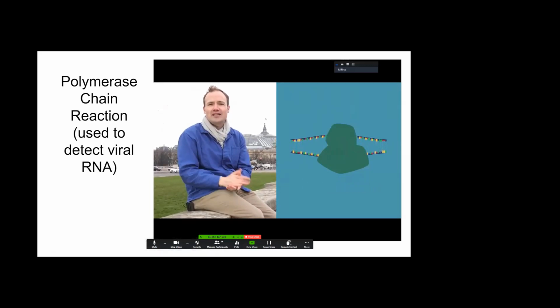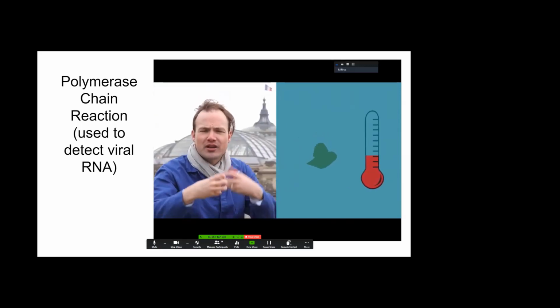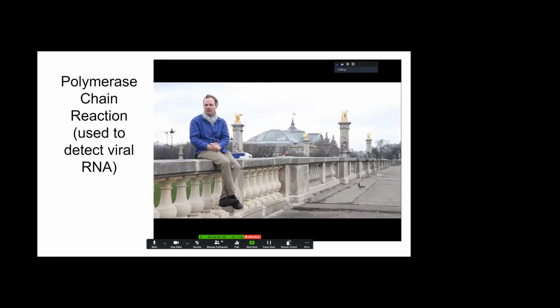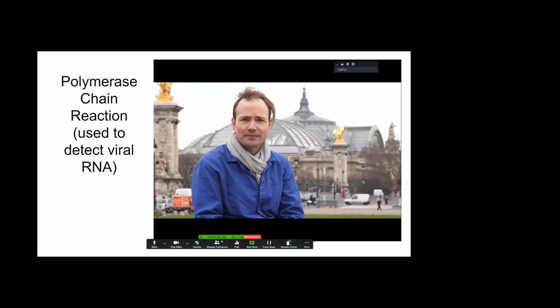But not just any DNA polymerase will do. Your average DNA polymerase, like most enzymes, will denature at high temperatures. At 50 or 60 degrees, the protein melts, unfolds, and turns into spaghetti. As we'll see today, we need something that can take the heat. So, back in the old-timey days, like the 1970s, some clever people started isolating DNA polymerase enzymes from microbes living in hot springs, which are very hot.